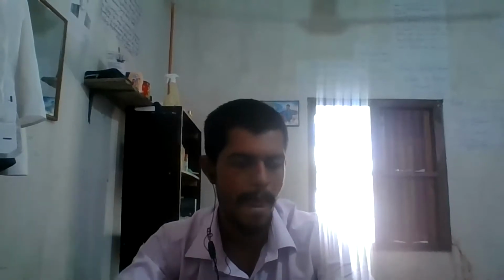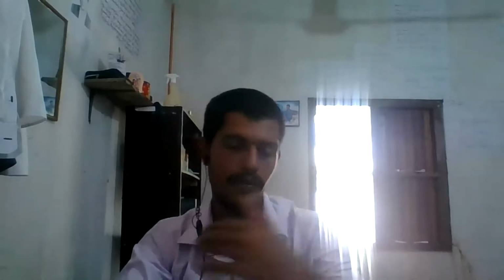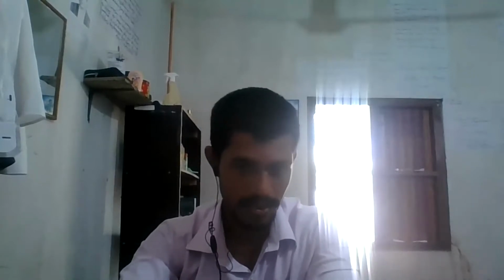So I think you are all here, but what will happen if we further increase the temperature to more than 79 degrees Celsius? We try to find out the difference, and we increased it and tried to find out the fire point of the diesel, right? Then we found it. I saw it in another video.